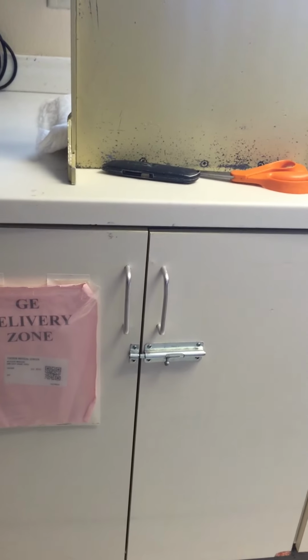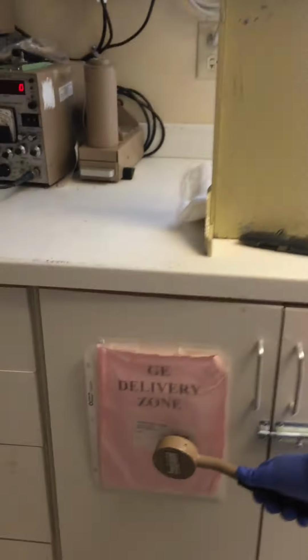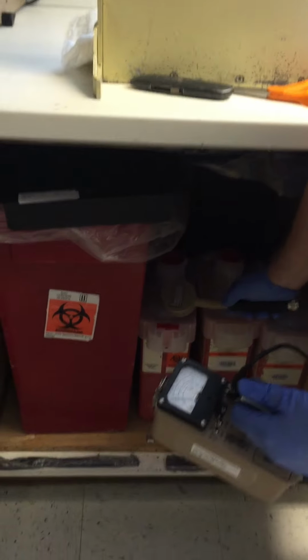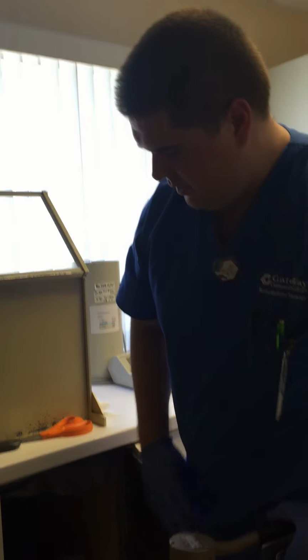What happens if you open it up? How does that change how much detection is going on? So if you open it up, it'll be a lot more. So I'll show you. So with the shield, you can see it has a relative amount. And if we were to open it, maybe on the other side, it's actually about the same. It's about the same because it has decayed. But we'll take a look at this over here.